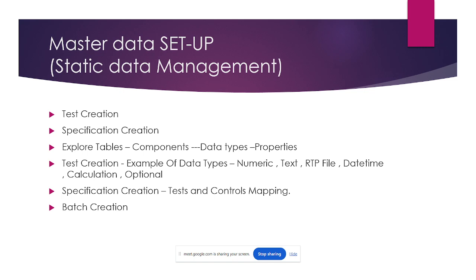Okay, and then batch creation will be there. This batch creation is for when some persons perform multiple samples at a single time, at the multiple samples creation time.